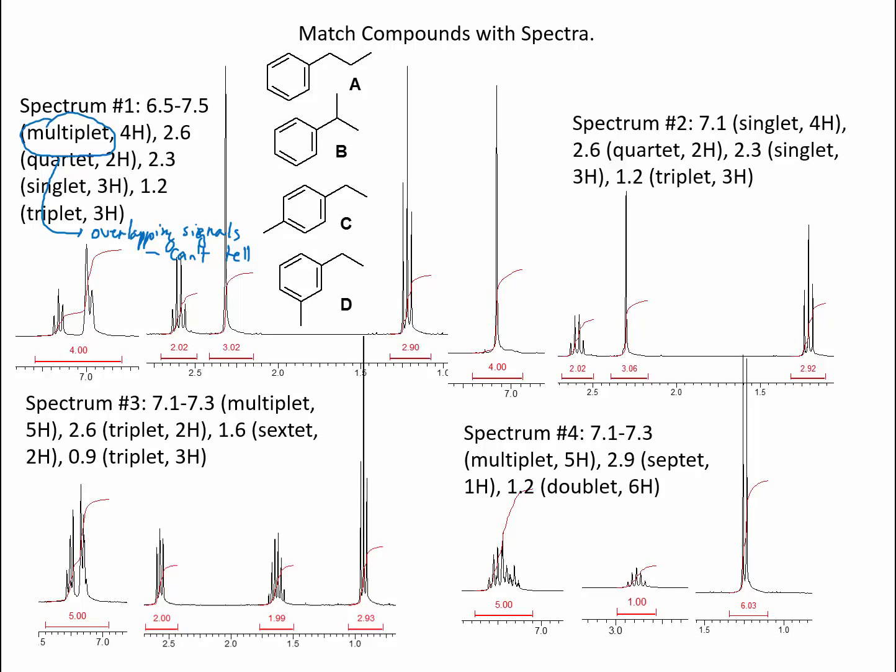Okay, it's important here to distinguish the difference between aromatic signals and hydrogens at sp3 carbon. Notice that each of these spectra have a little break here. This is because there's a large section of the spectrum that doesn't have any peaks, and we want to blow it up so that you can see what is what. All right, so what we see total, there's 4 hydrogens in the aromatic region. Let's just look at the ratio of hydrogens at sp2 carbon to hydrogens at sp3 carbon.